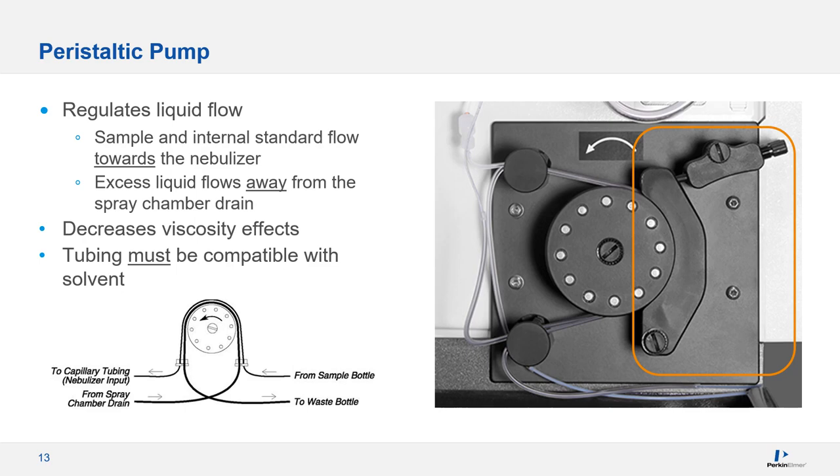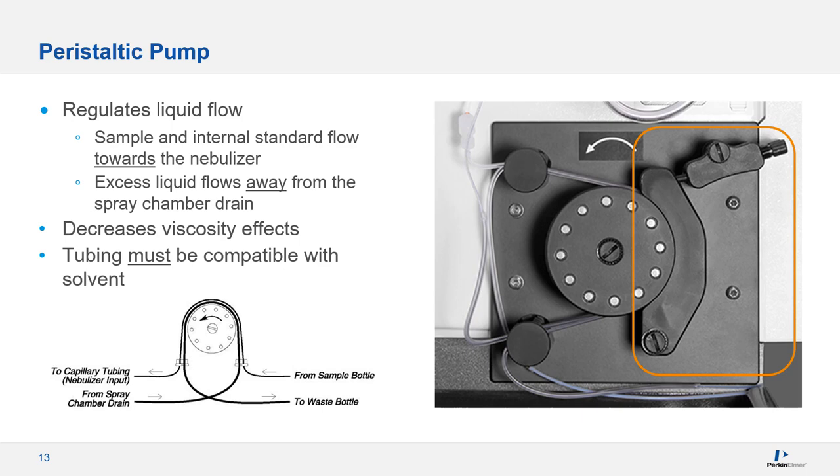Maintaining the tubing itself is critical. It is a consumable. Keep in mind that the typical lifetime of a piece of tubing is about 8 to 12 hours of operation. If you notice that it's flattened, you should definitely change it. Worn tubing will affect the precision or reproducibility of your results because the pump isn't able to deliver a constant flow.